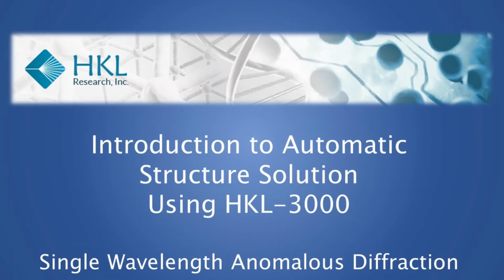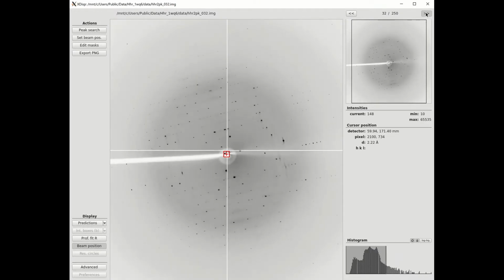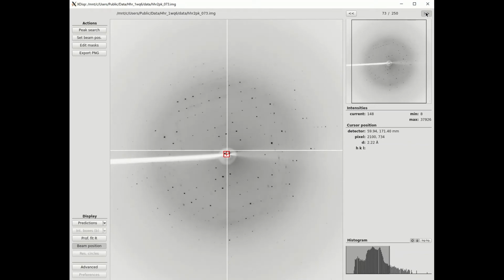Welcome to HKL Research's Introduction to Automatic Structure Solution using HKL-3000. This video focuses on using the automatic features built into HKL-3000 to go from raw diffraction data to an almost complete structural model using the Single Wavelength Anomalous Diffraction, or SAD, method.